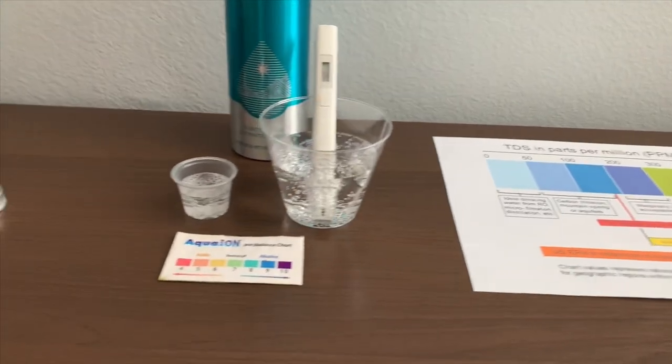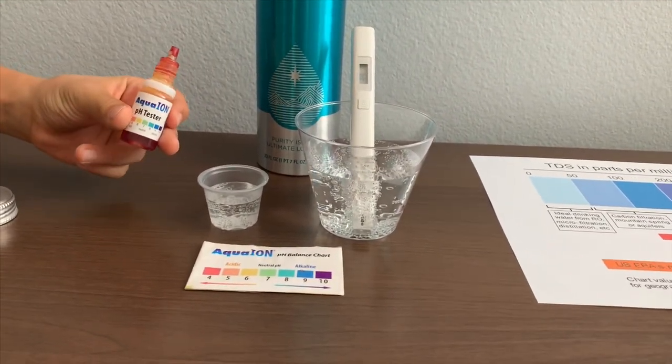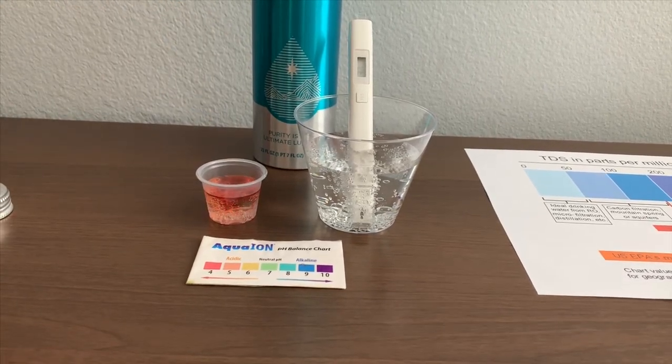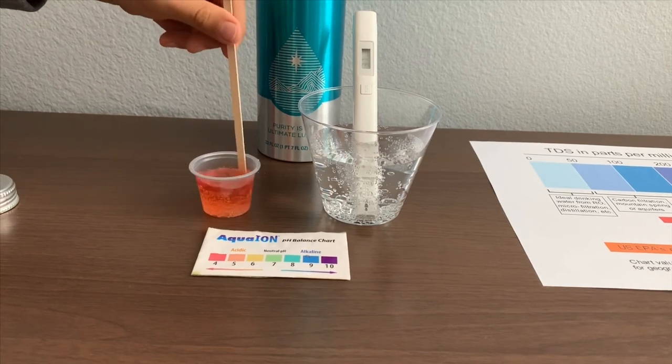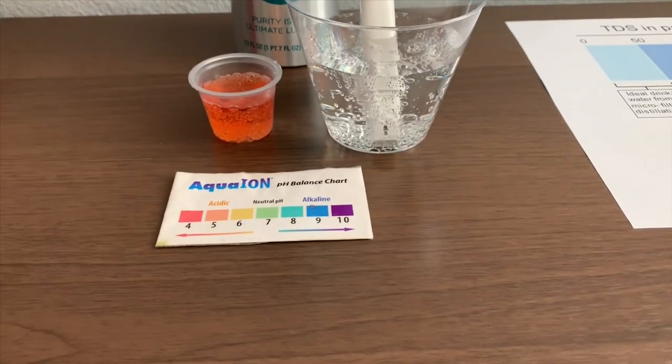Now let's test the pH level. If you want to buy this pH tester, check the link down below. Only do two drops. Stir it a little for a better result. I give this a 4.5 — this is acidic.